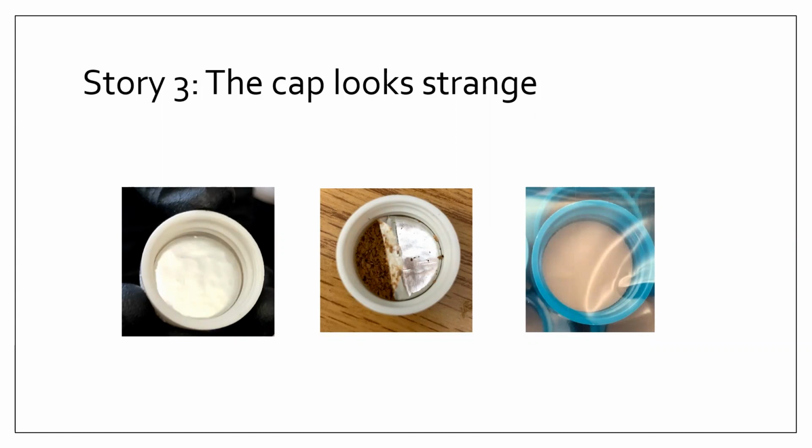So just remember what you are going to use in your solvent and how you store your chemicals, because you really don't want to introduce contamination. That is also why temperature is important: if you have to put it in the fridge to prevent bacteria growth, put it in the fridge.